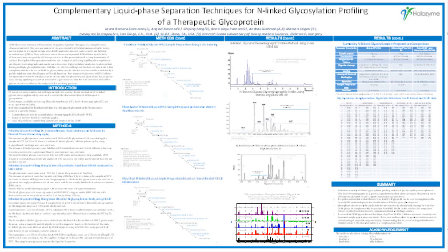Okay, we've got a couple more questions here. One is, how many samples do you typically run per week, and what would improve your workflow? It really depends. In our lab, since we contract things out, we are just working on our early FIH, and it depends on the stage of a program. We could be running up to 40 samples in 1 week, or we can be running 5, depending on the level of work and how many programs we're doing.